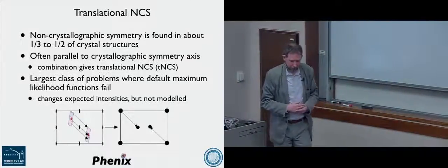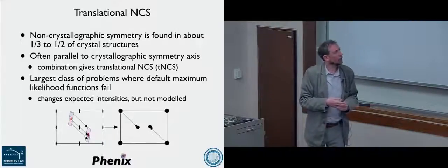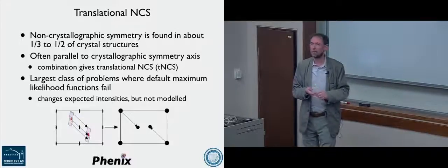So the first issue is unusual intensity distributions, and the topic here is translational non-crystallographic symmetry. Has anybody encountered that in their crystals, translational non-crystallographic symmetry?